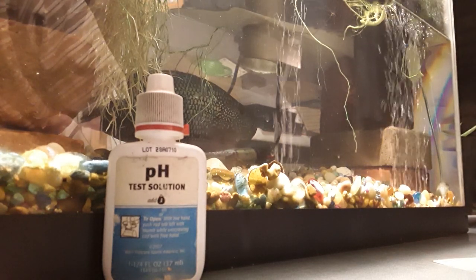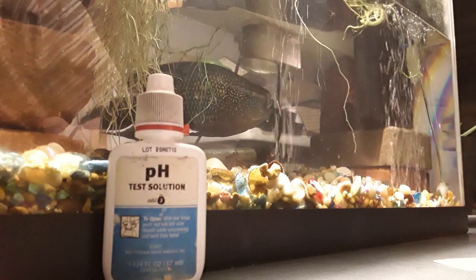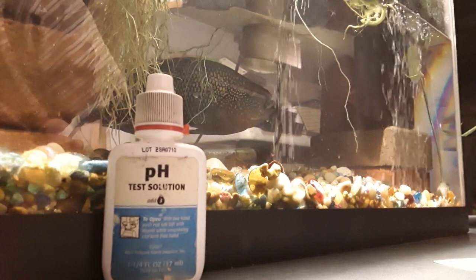Today I'm going to be doing various aquarium tests for the water quality. First I'm going to be doing a pH test.